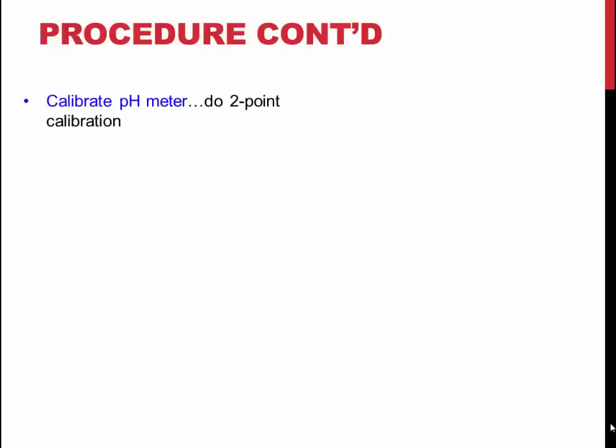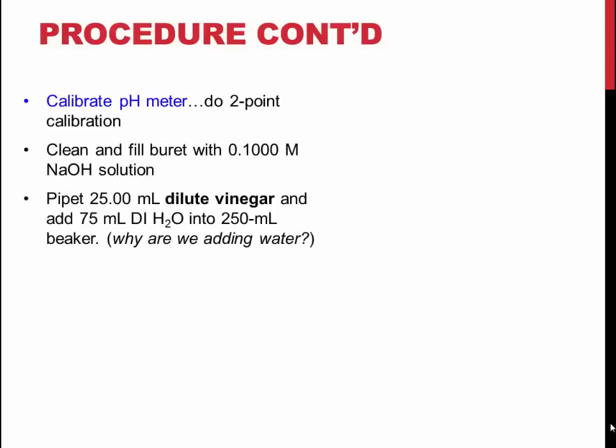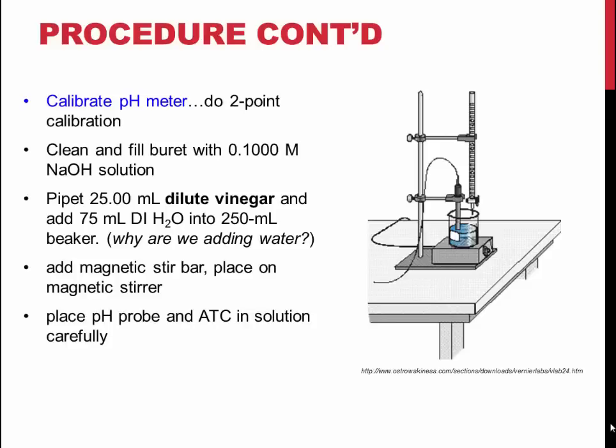To prepare it for analysis, rinse a burette and fill it with 0.1 molar sodium hydroxide. Pipette 25 mL of your diluted vinegar solution into a 250 mL beaker and add 75 mL of deionized water. Add a magnetic stir bar and place the solution on top of a magnetic stirrer. Be careful to keep the pH electrode away from the magnetic stir bar when you turn it on.